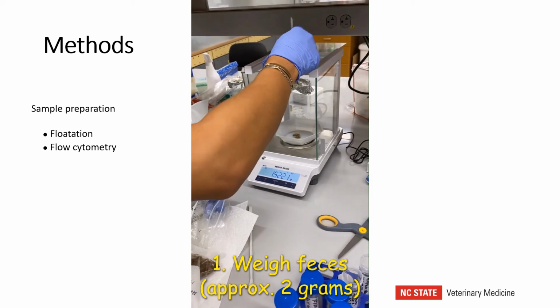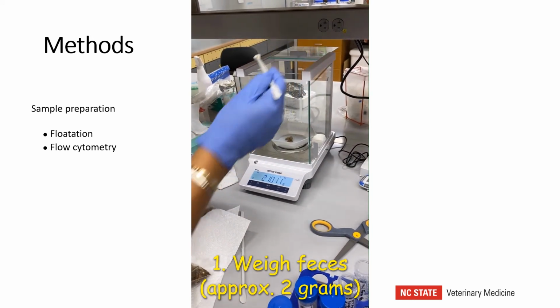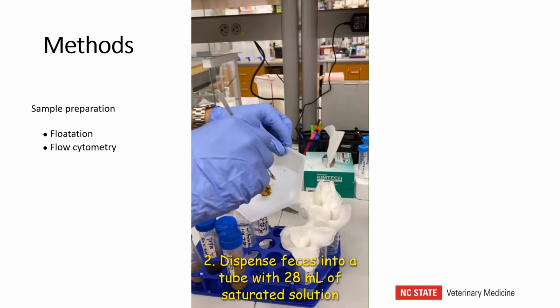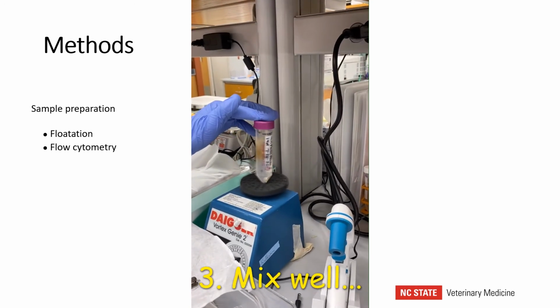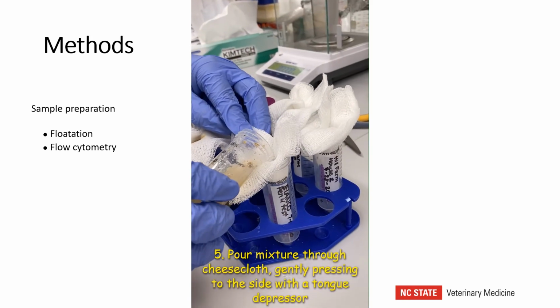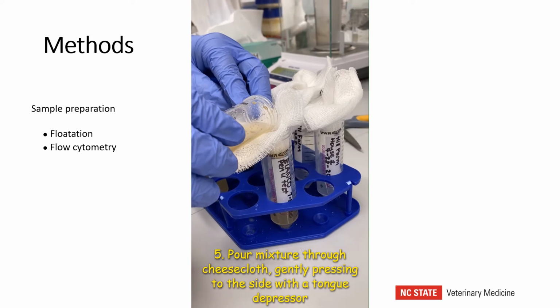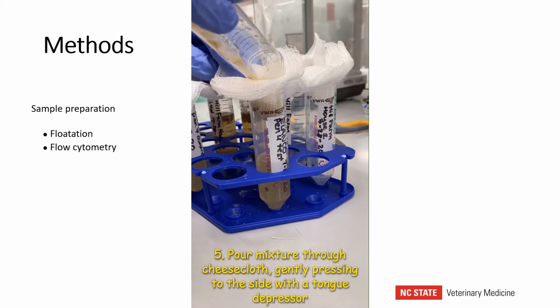So let's review how we prepare the samples for flotation and flow cytometry. First, we weigh the samples, put them in tubes that have a saturated solution of salt, mix them well, and put the mixture through a cheesecloth to remove larger pieces of debris.